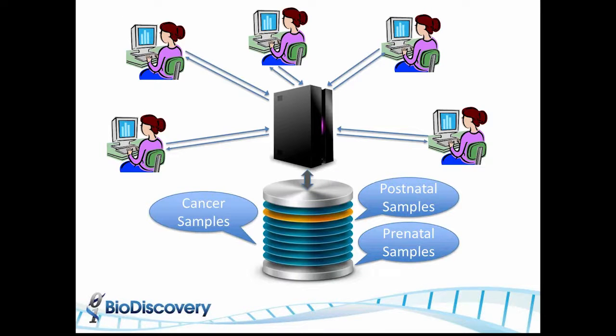So the last slide here just talks about the architecture. As opposed to being just a desktop software that sits on your computer, that's the client. But really the heart of the system is the server that communicates with all these clients and provides them access to the entire database of all the samples and helps them leverage the knowledge gained from the reviews from each other.